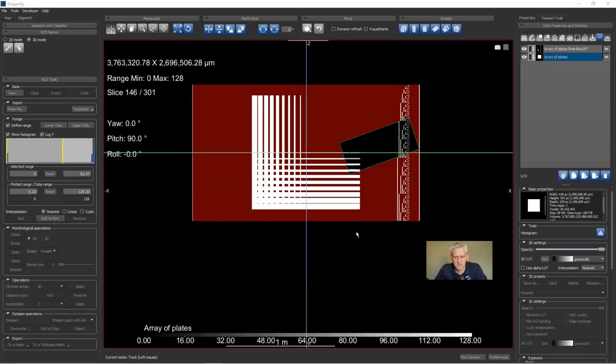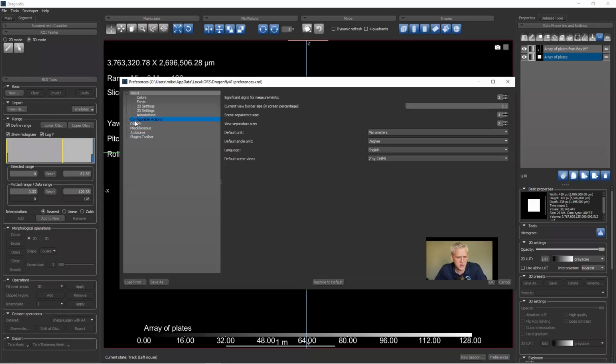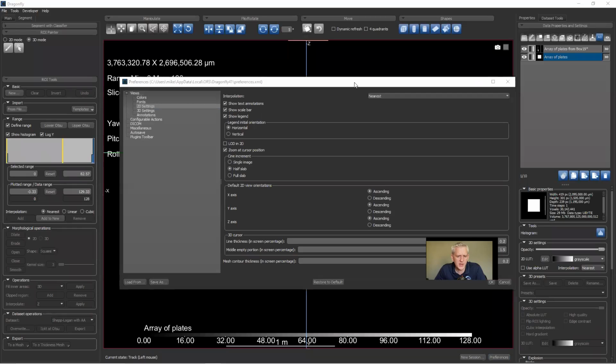I don't think you can, and that's why I don't like answering this question. I wish you could. I think we should add that for Dragonfly 2020.2 for this fall, because there are times when you would like something other than red and to change the opacity. So we should add something over here where you could just toggle the behavior. So we don't have it, but let's see if we can get it in the future.